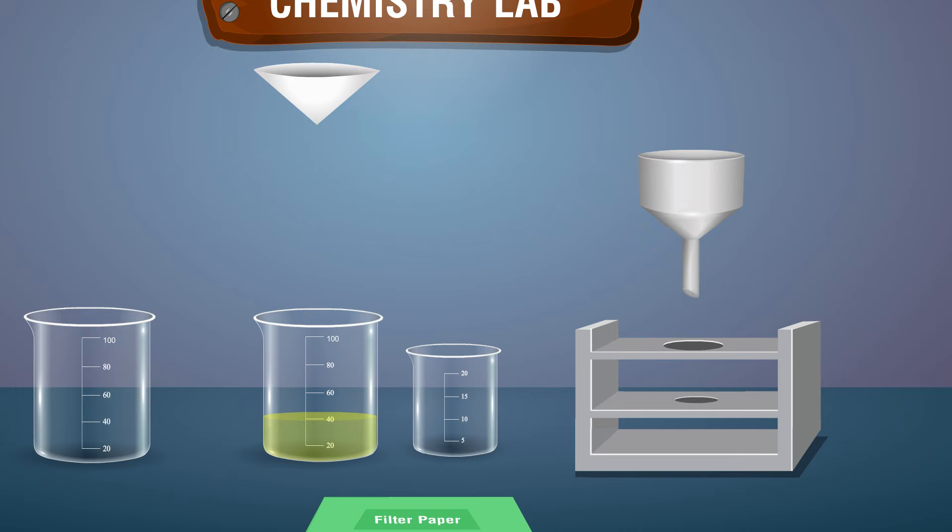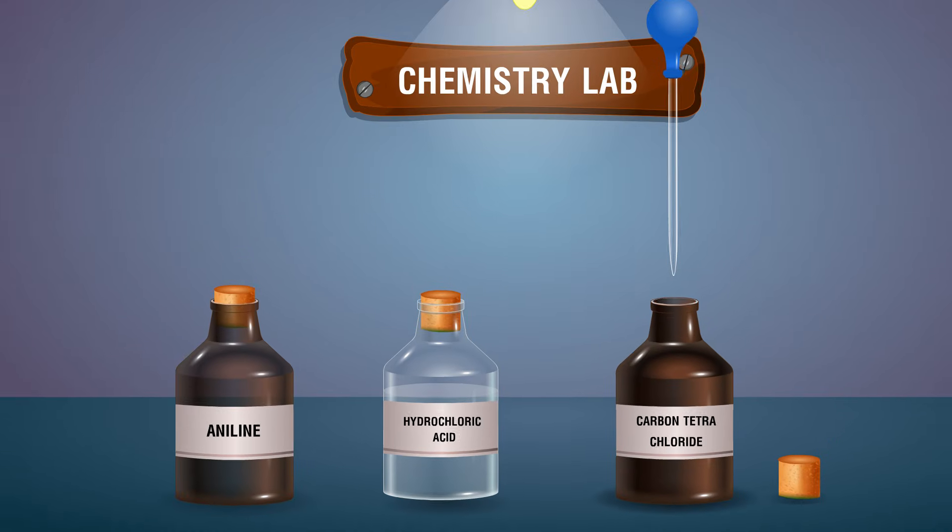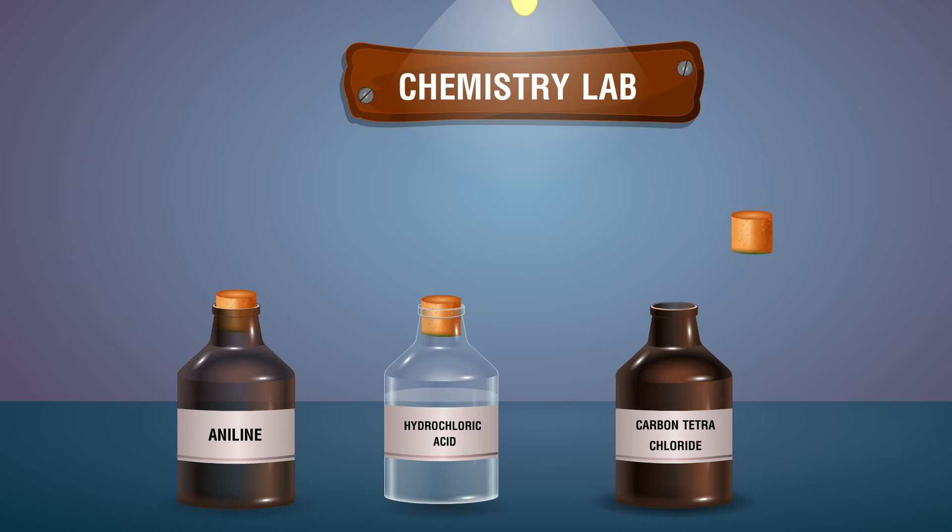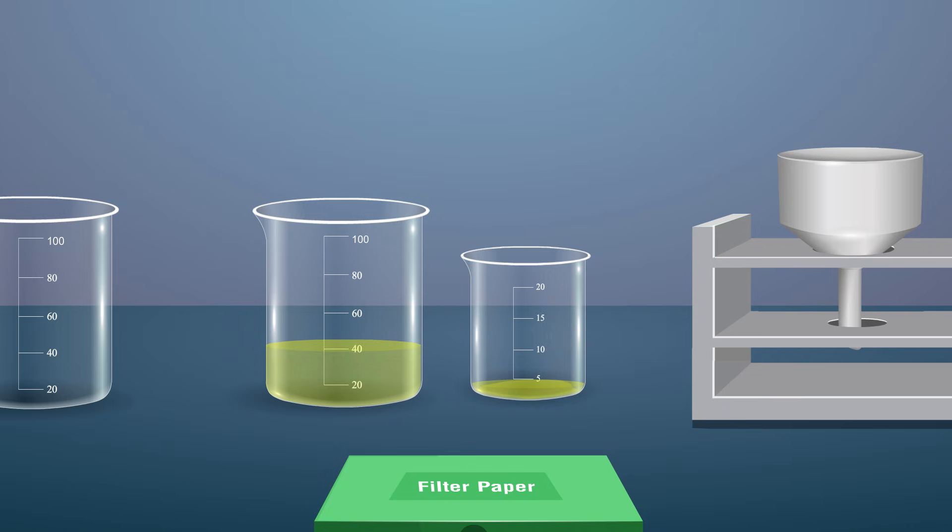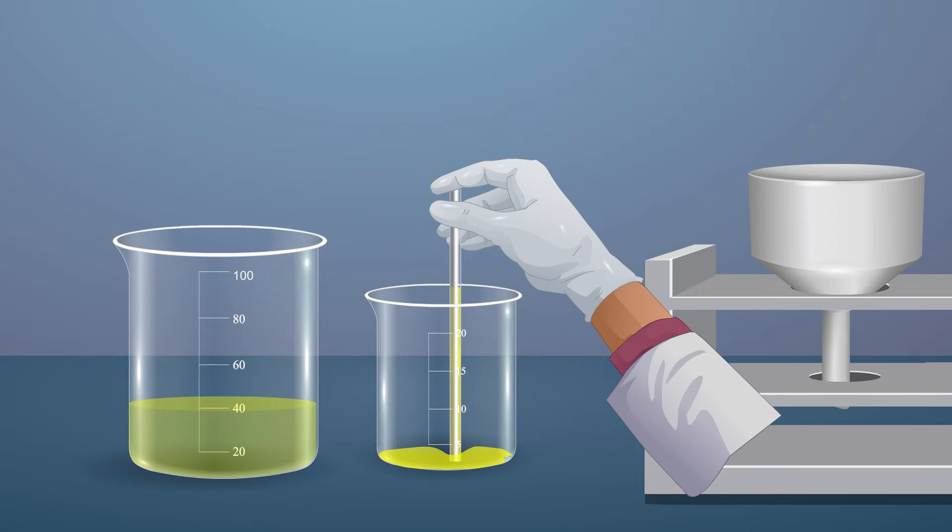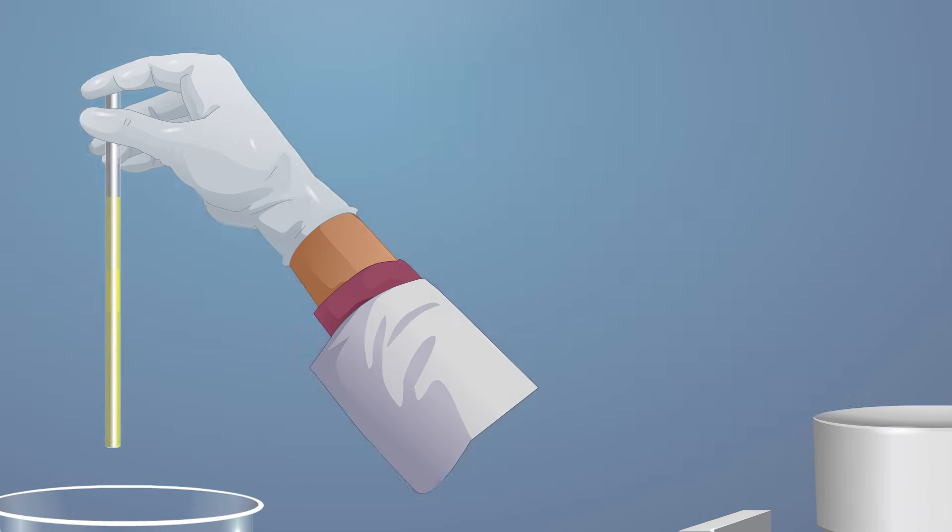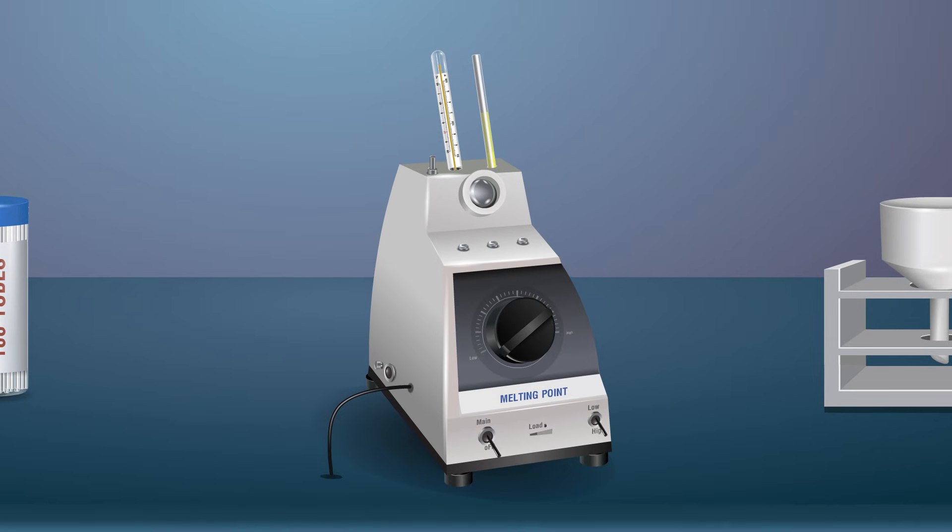Recrystallize the crude sample. Transfer the crude sample into the beaker and add carbon tetrachloride using a dropper into the beaker to get the pure dye. Take some compound in the one end closed capillary and place it in the melting point apparatus. Place a thermometer in the melting point apparatus to note down the temperature.